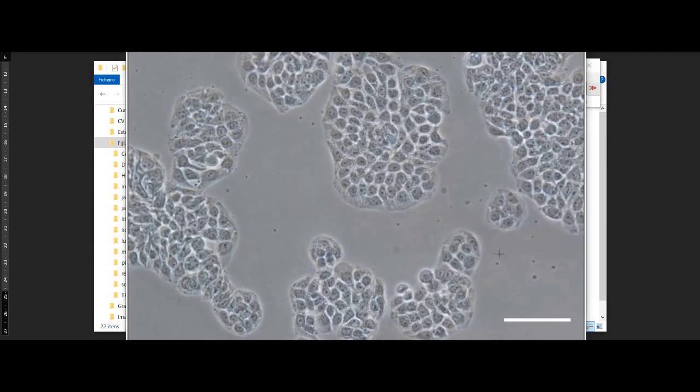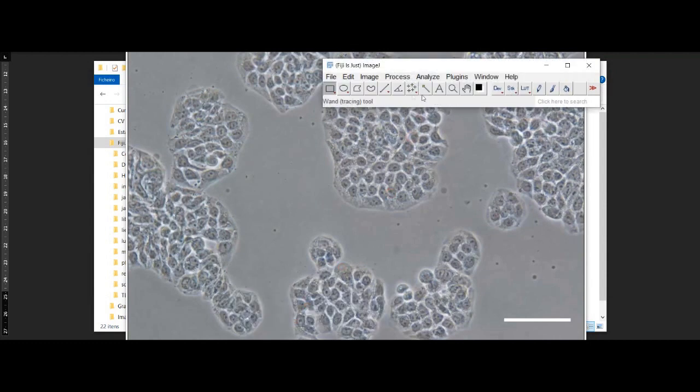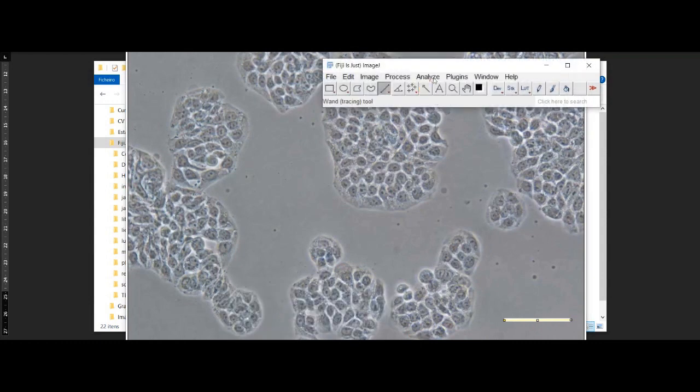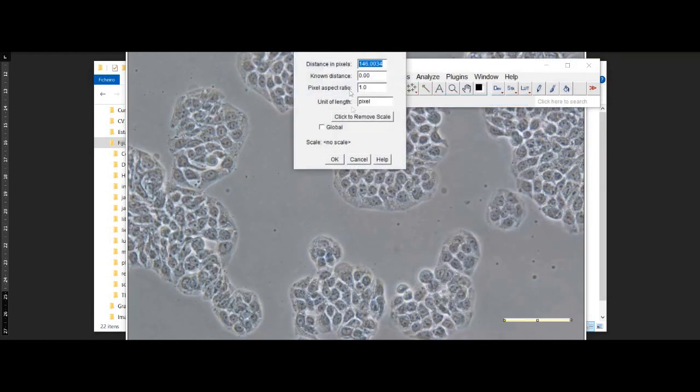Now that we have our image loaded, let's begin the counting process. The first thing we need to do is set the scale of our image. This step is important because it allows us to measure the size of the cells accurately.